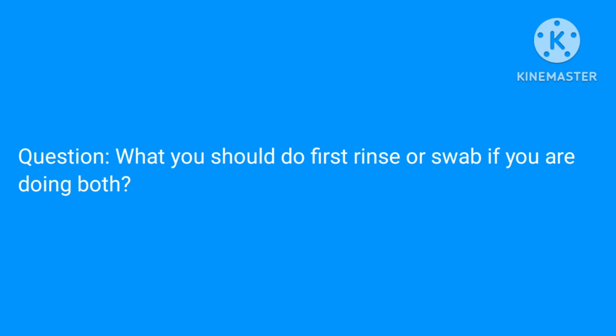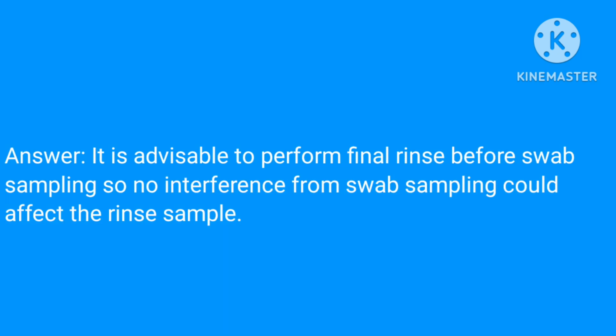What should you do first, rinse or swab, if you are doing both? It is advisable to perform the final rinse before swab sampling, so that no interference from the swab sample could affect the rinse sample.